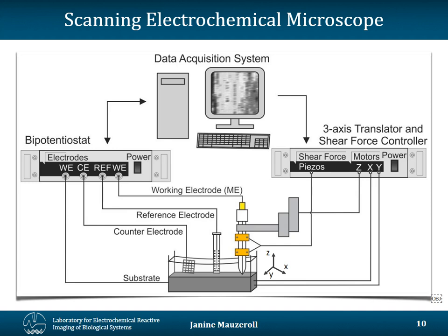Now, in some systems, you can also have additional distance controllers, like a shear force controller, for example, that consistently monitors the tip to substrate distance if your objective is to perform a measurement at a constant distance. And there are several different types of ways by which you can keep a constant distance. Many people are actually professionals at building their own instruments. So I'm just trying to provide you with one example of how an SECM microscope works.